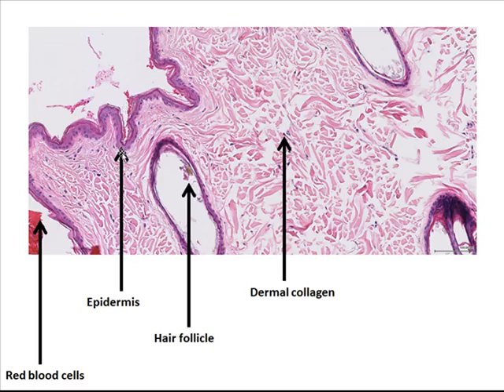The epidermis again is being pointed out to you here in this case. Here's a hair follicle again here. This one's a little bit more dilated, and there's a bit of a remnant of a piece of hair in this one. It's not so discrete as the ones we were just looking at. And again we've got the dermal collagen, the supporting connective tissue that's sitting underneath the epidermis, just being pointed out to you here.